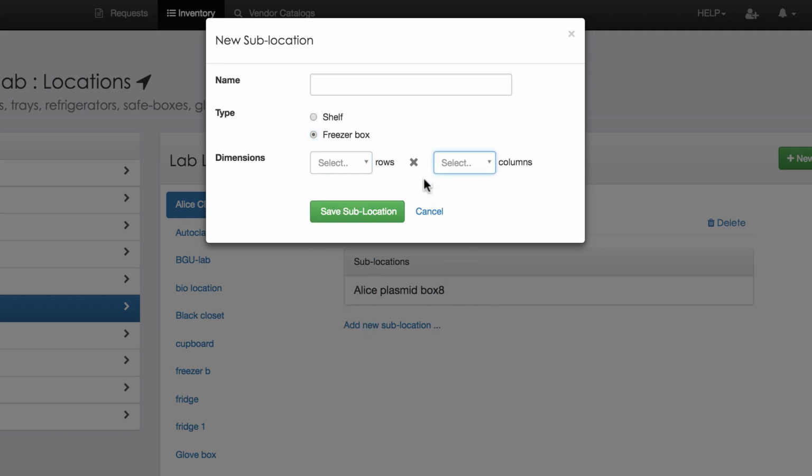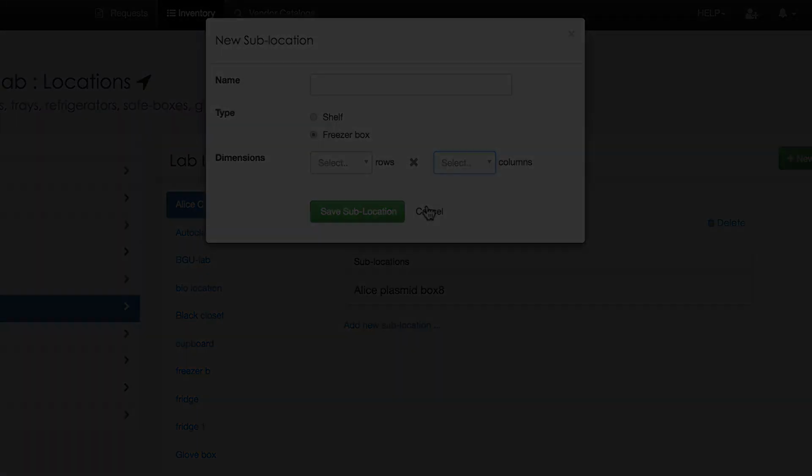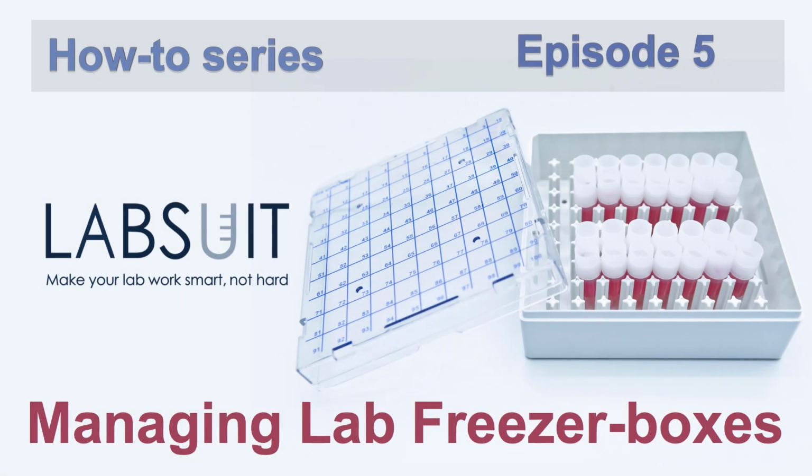Freezer boxes are covered in detail in the next episode. So stay tuned for episode number 5 and I will talk about freezer boxes.